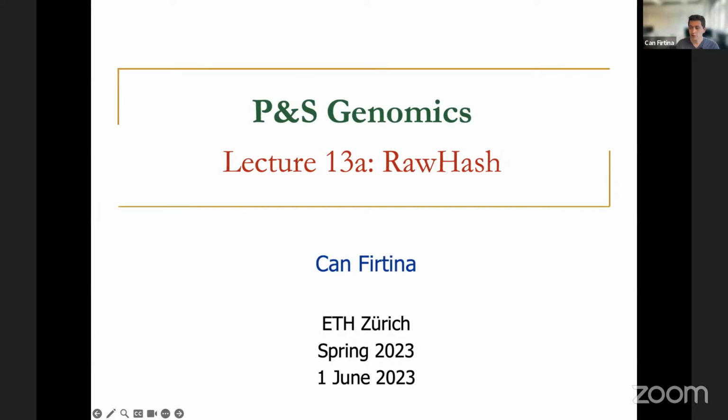All right, welcome everyone. Good morning. Today we're going to present two of our recent works. I'll first start with RawHash, a tool for mapping raw nanopore signals to reference genomes. And the second work is going to be presented by Banu, a work called TargetCall to quickly filter out unuseful nanopore raw signals without fully base calling them, let's say.